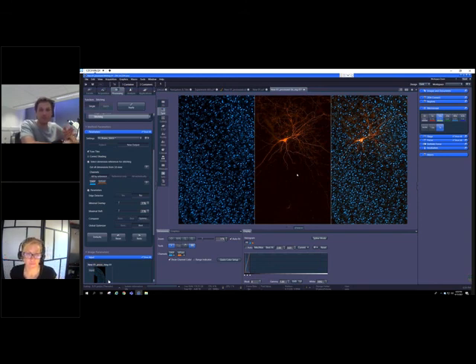Of course, it's not a pure optical section, but if you would like to upgrade your wide field setup with the deblurring option, which is a very fast option, you can also do true optical sections using our Apotome, which is a hardware device generating a structured illumination and allowing to calculate true optical sections.